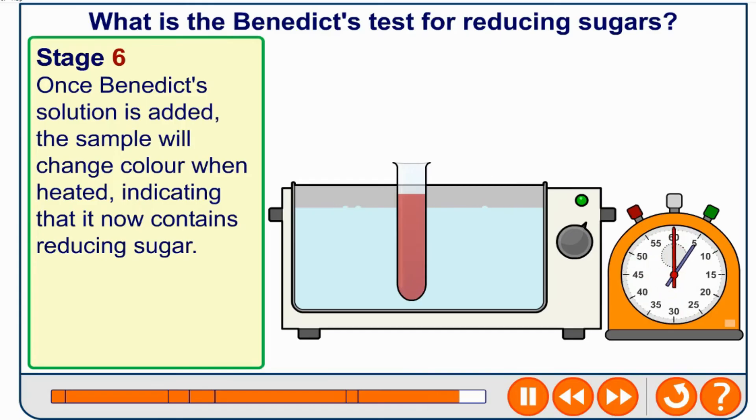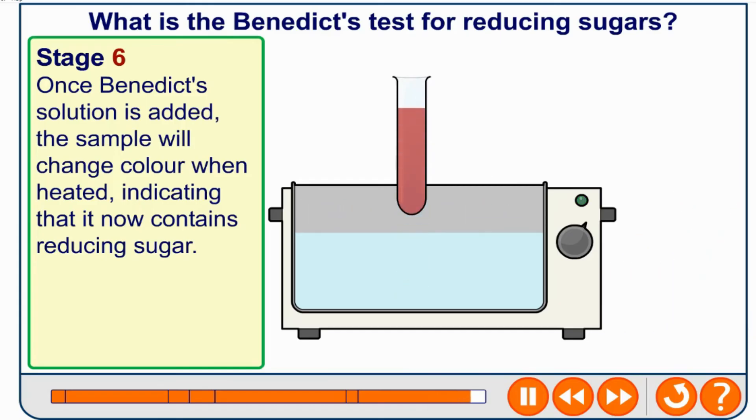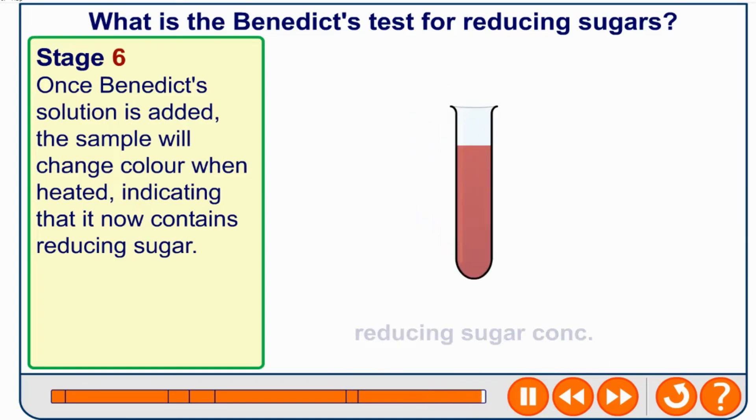If reducing sugars are present it will change colour. As you can see, it now contains reducing sugar and it is at a high concentration. That is the Benedict's test for reducing and non-reducing sugars.